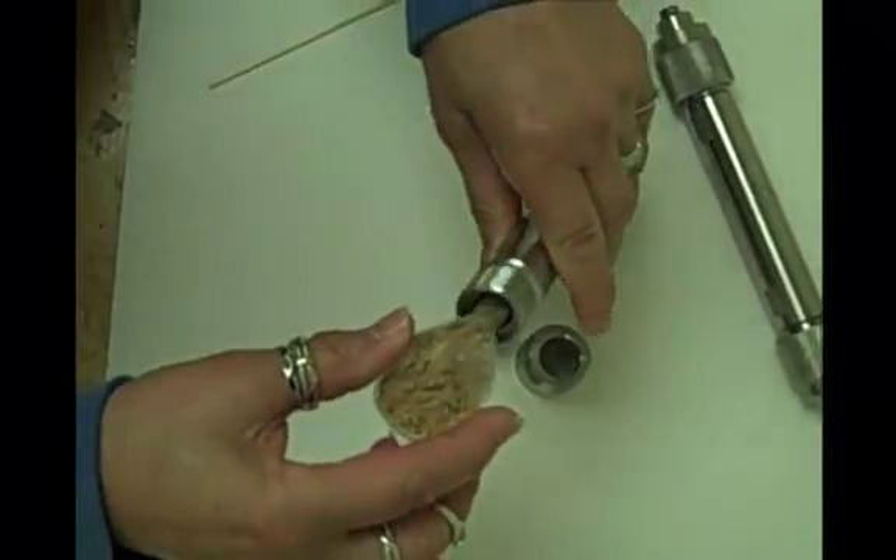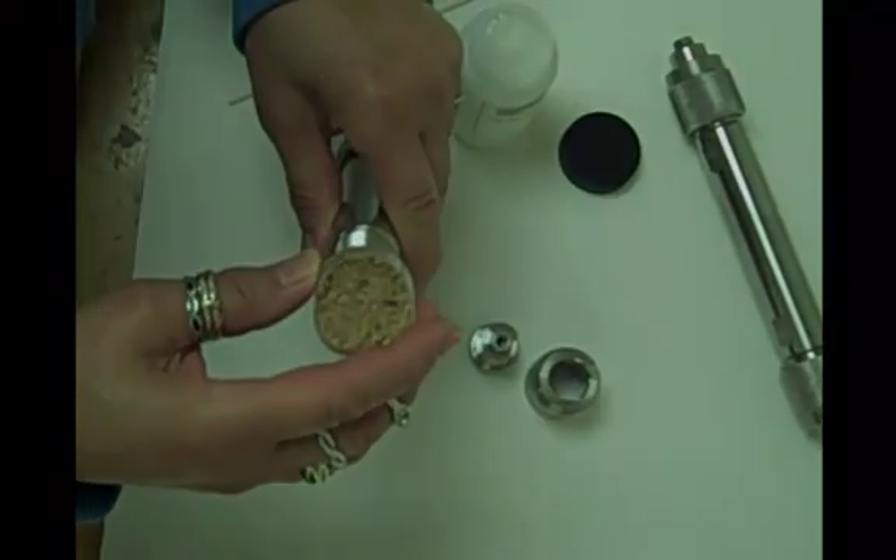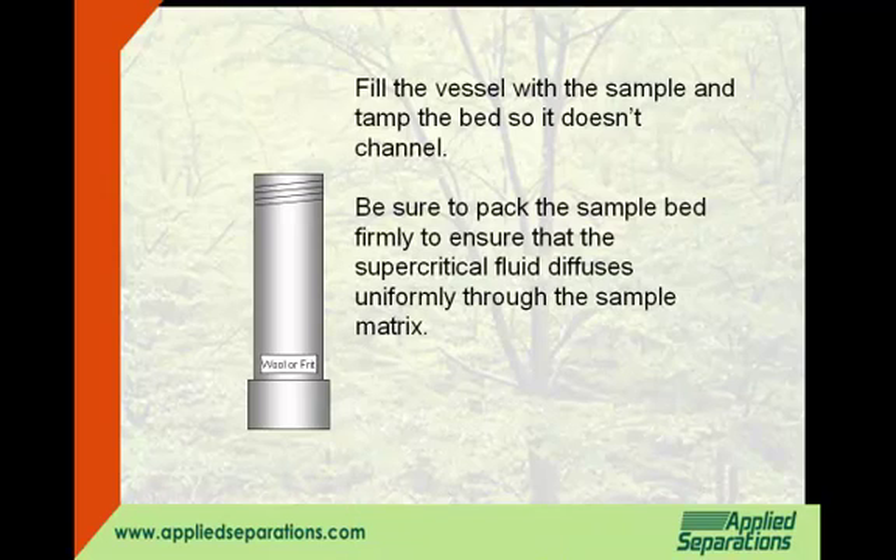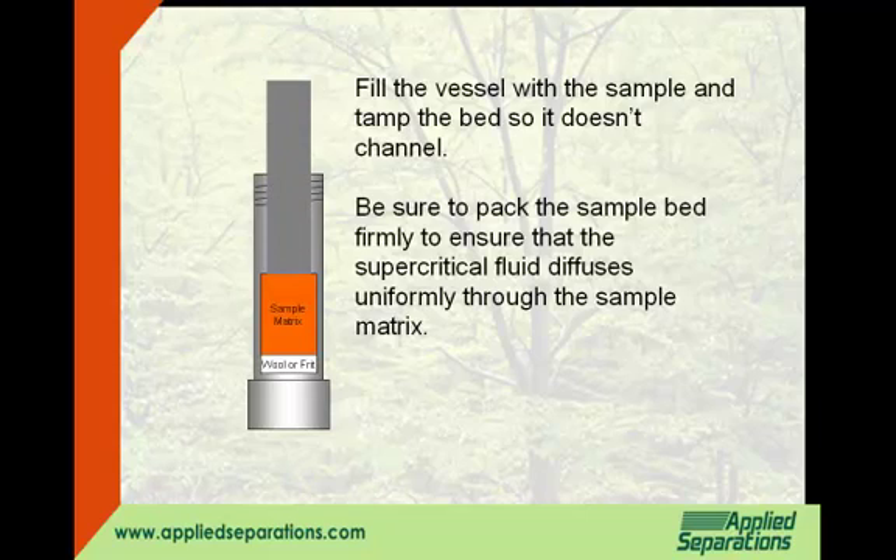Fill the vessel with sample and tamp the bed so it doesn't channel. Be sure to pack the sample bed firmly to ensure that the supercritical fluid diffuses uniformly through the sample matrix.